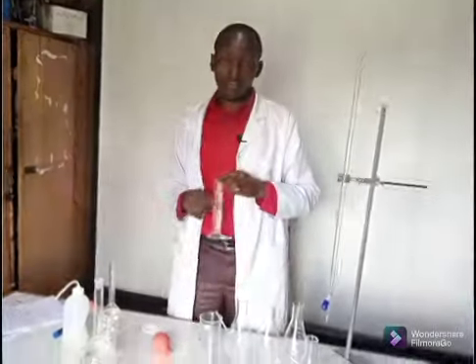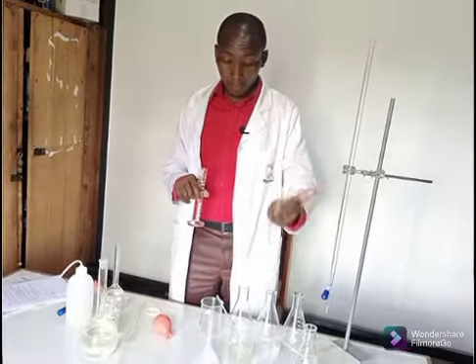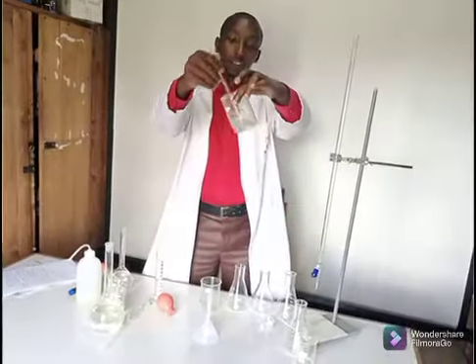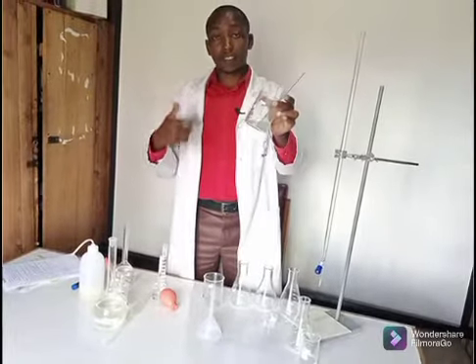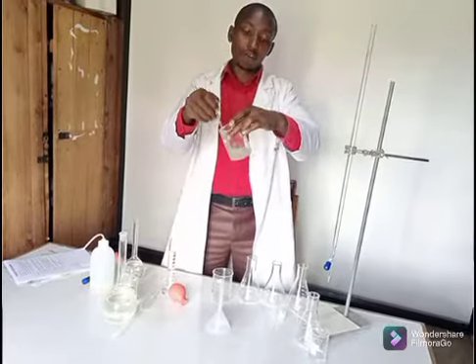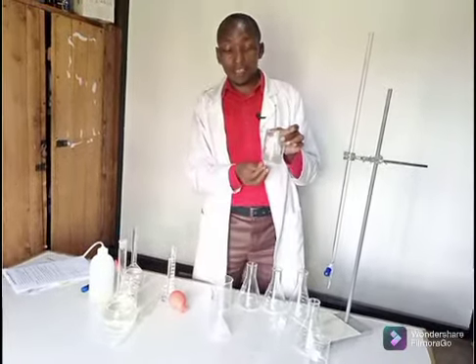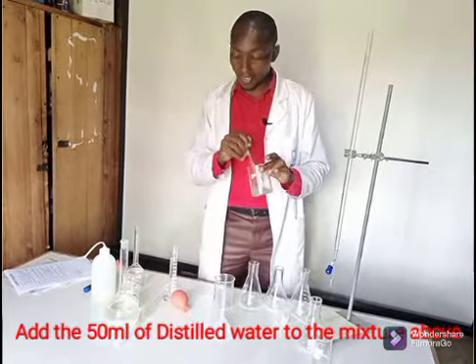In step number one, we measured 50 of the acid, the solution labeled P. Then we added the carbonate on top of it. And as you can see, all the carbonate reacted, telling you the acid was in excess, because that is one essence of back titration. The acid is in excess, so the unreacted acid here is what we're going to analyze.